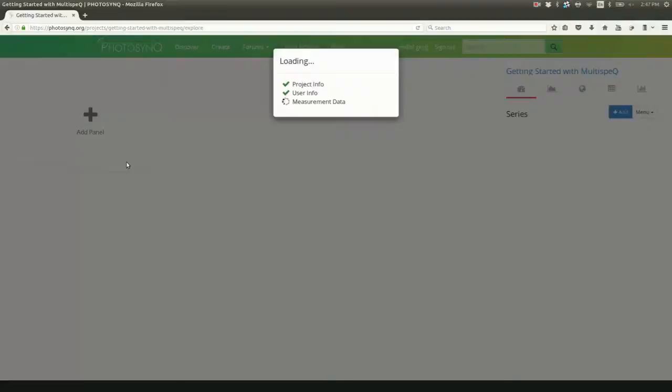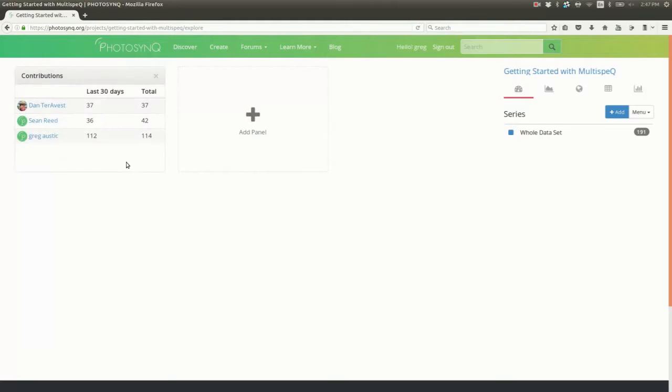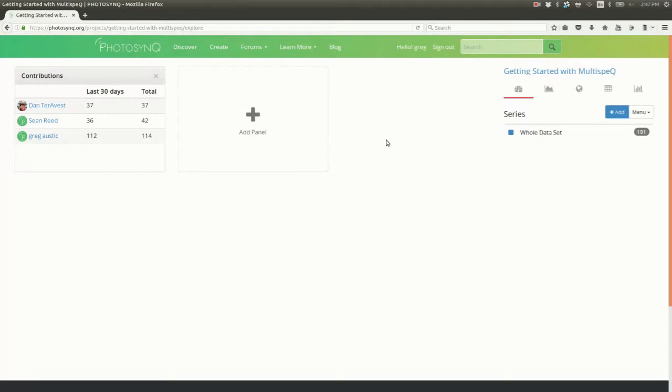Alright, the data is done loading. This is the Data Explorer. It's a powerful tool with lots of features. I'm just going to describe a few to get you started.